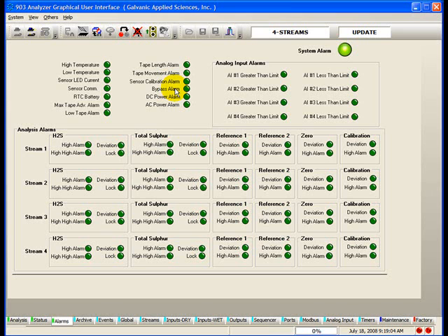Bypass mode is a mode of the analyzer that disables any outputs that may be triggered by alarms. This mode is useful when doing any kind of service work that may result in triggering of alarms. For normal operation, it is essential that bypass mode be disabled.